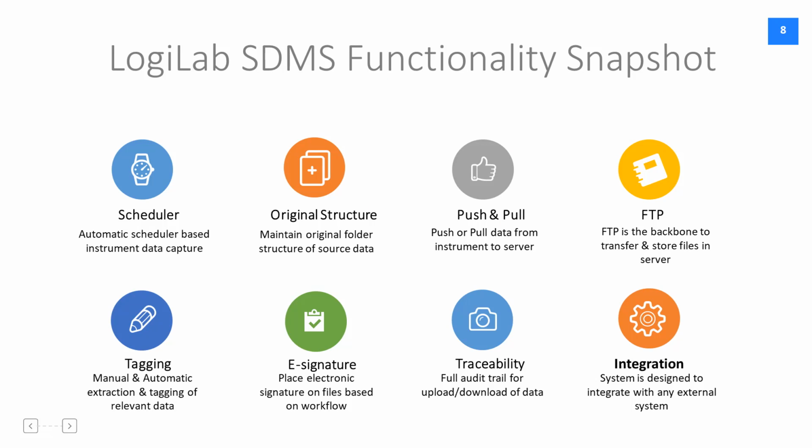Coming to a snapshot of the functionality of LogiLab SDMS, it has a scheduler, which is an automated scheduler for capturing instrument data, and the storage structure is exactly a duplicate copy of the original folder structure followed by the instrument software.